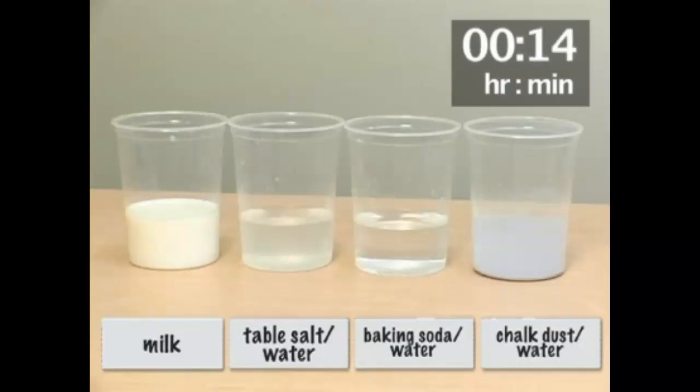We allowed each mixture to sit for an hour to see if the solid materials in them settled out. We did this because the best test for a suspension is to observe if the particles in the mixture remain suspended. If the particles settle out, then the mixture is a suspension.